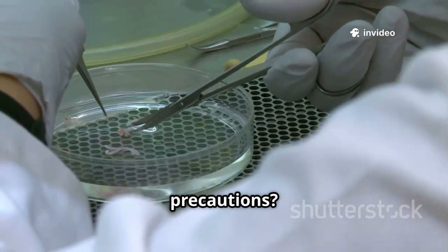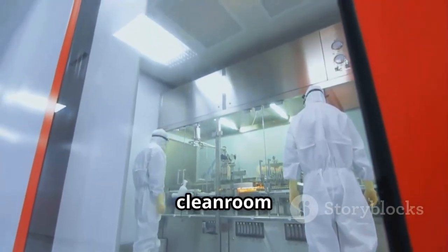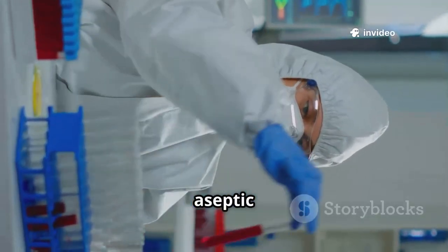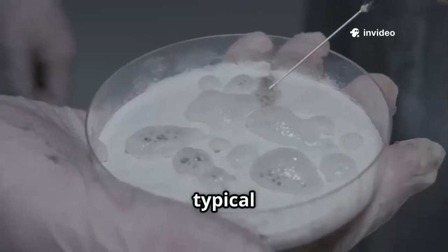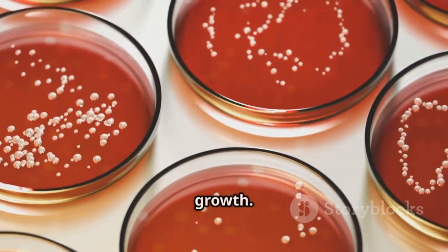What about precautions? Sterility testing must be performed in a Class 100 cleanroom or laminar airflow hood by trained personnel under aseptic conditions. Environmental monitoring is a must. How long does it take? A typical sterility test runs for 14 days to allow time for microbial growth.